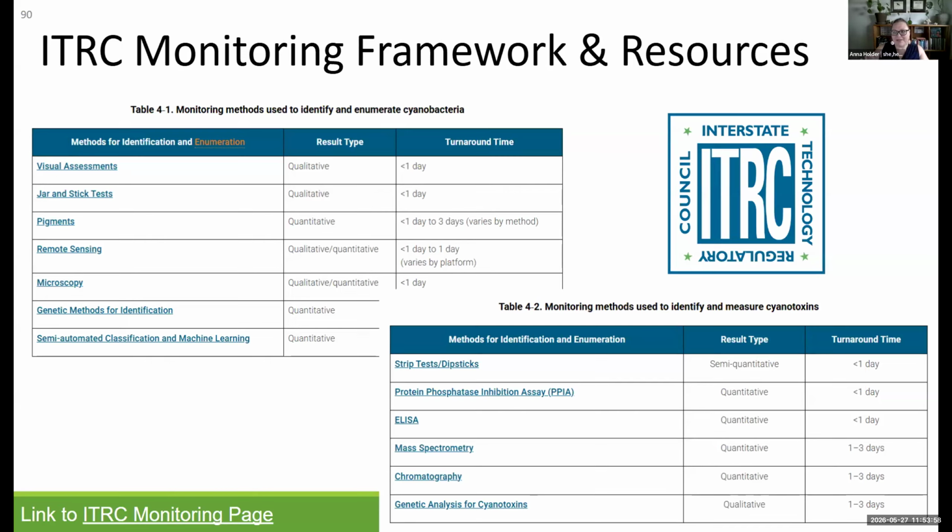Marissa, did I miss anything about this site that you wanted to flag? Yeah. They have a lot of incredible videos of real-life spaces that have HABs, or before they have HABs, to understand how this differs, to support training. They've also consolidated a resource center, particularly on how to do microscope identification.